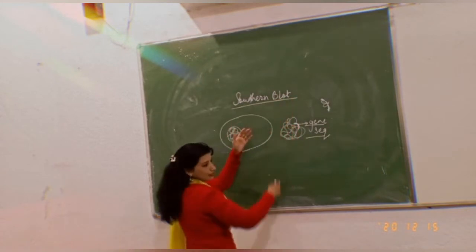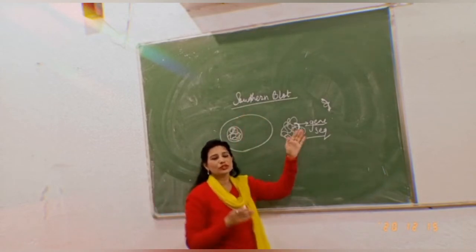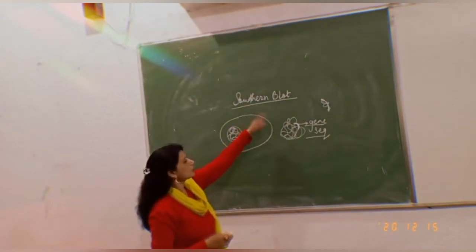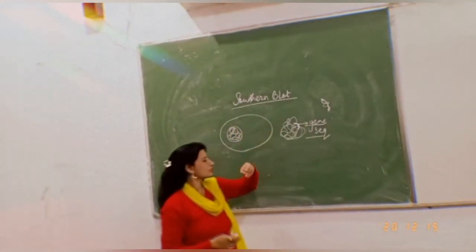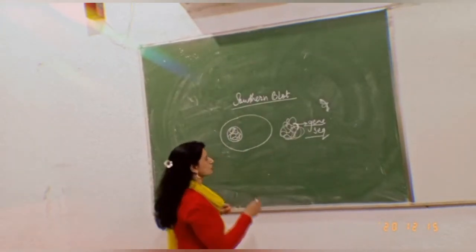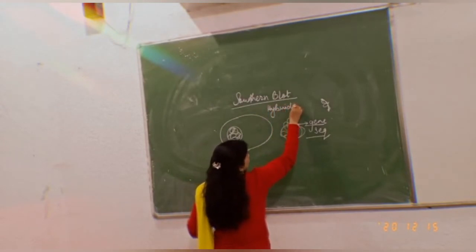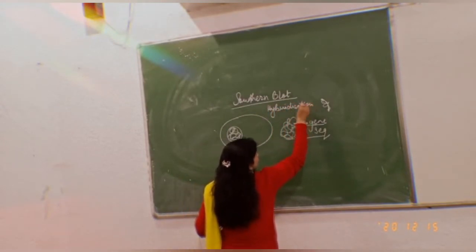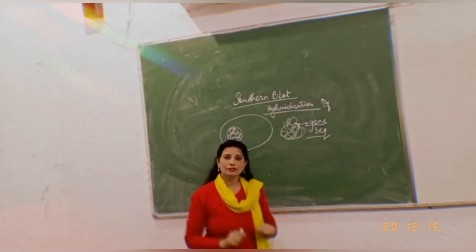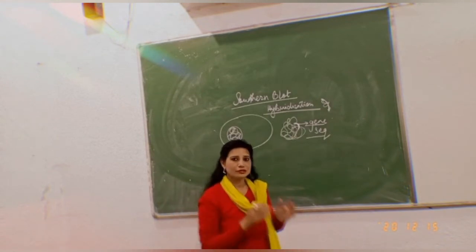This technique is very important to understand because it is related to DNA fingerprinting, which is known as DNA profiling. This technique helps us analyze a particular DNA sequence, and it is related to DNA hybridization. Now, you may ask me, what is hybridization? What does the central dogma say about the DNA molecule? A helical structure, a double-stranded DNA. It is always a double-stranded helical structure.